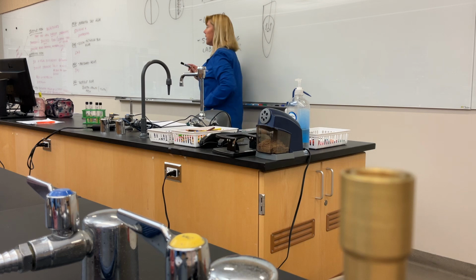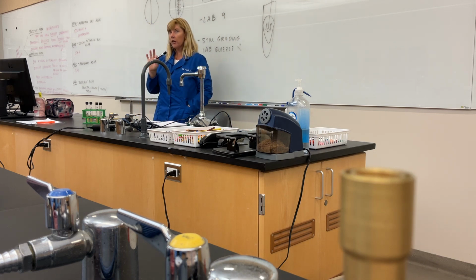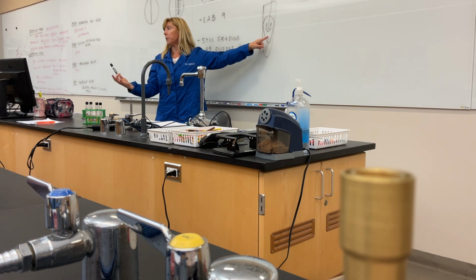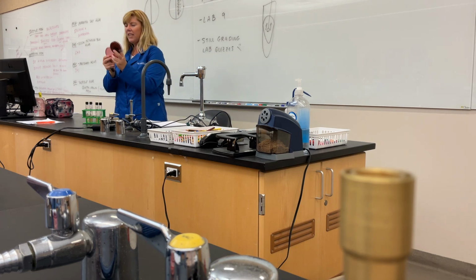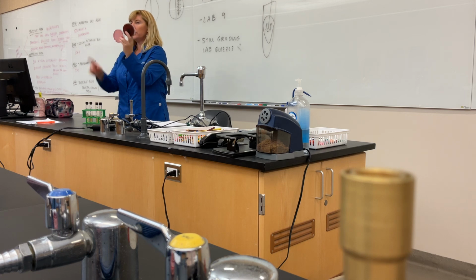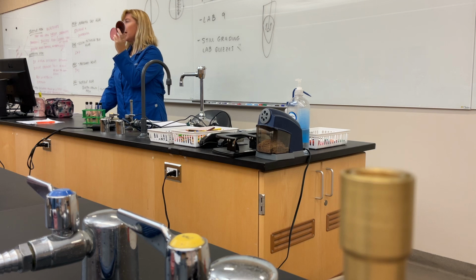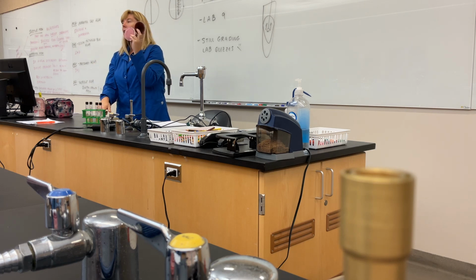Couple of hints I will give you. Be sure to flame sterilize longer than normal between your different organisms, because you will get carryover. If you're getting paste on your loop, you've got to get rid of all of that bacteria before you pick up your next sample. The other thing, I've had students try to do this in the past. They go, oh, it's the same bug, so I'll just get a big loop and I'm going to go here and here and here and do them all at once. Do not do that. There are different ingredients in each of these and you will get carryover.